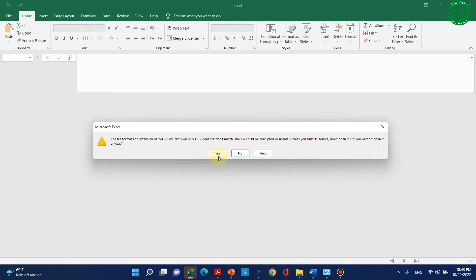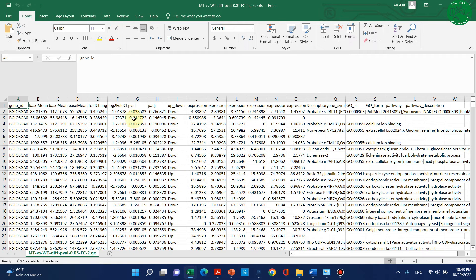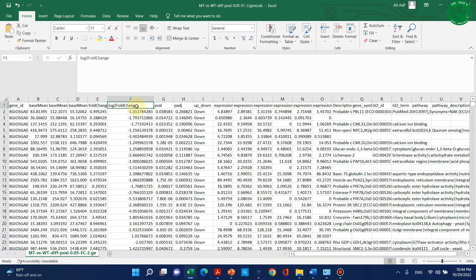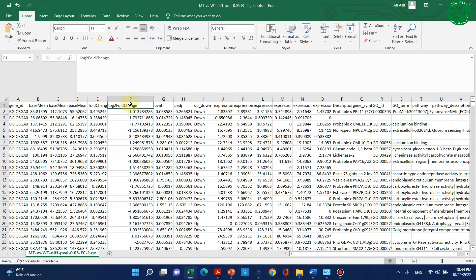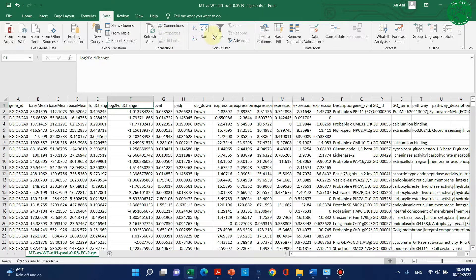First, open this list and figure out where the log2FC value is. Here you can see column F is actually showing the log FC value. We have to filter this column in ascending or descending order. Go to the Data tab and select Filter.